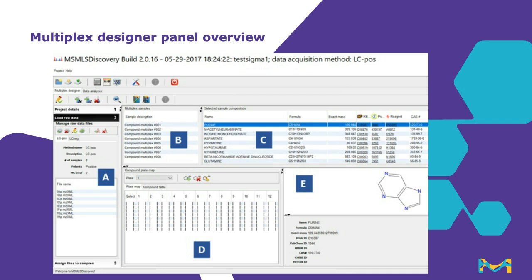There's a knife and fork icon, and this is the program preferences icon. This is used to set the search parameters, and I'll also describe this in detail shortly. There's a help window, and then the last icon in this row is the Save the Project and Exit button.